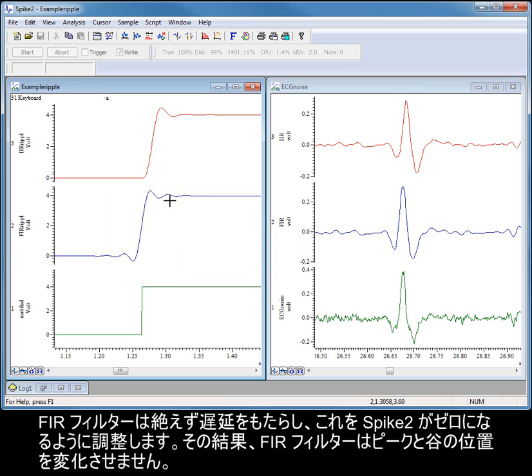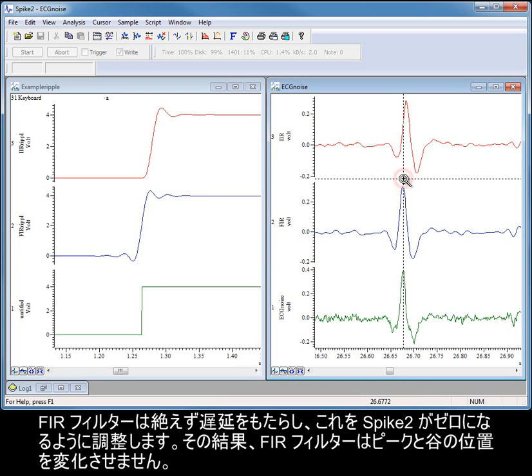FIR filters introduce a constant delay, which Spike2 arranges to be zero. Consequently, FIR filters do not shift peak and trough positions.